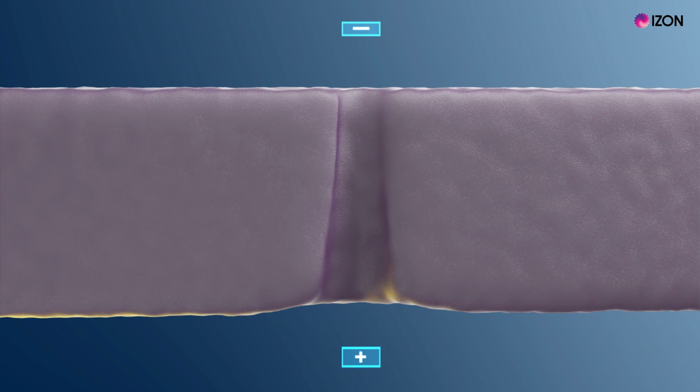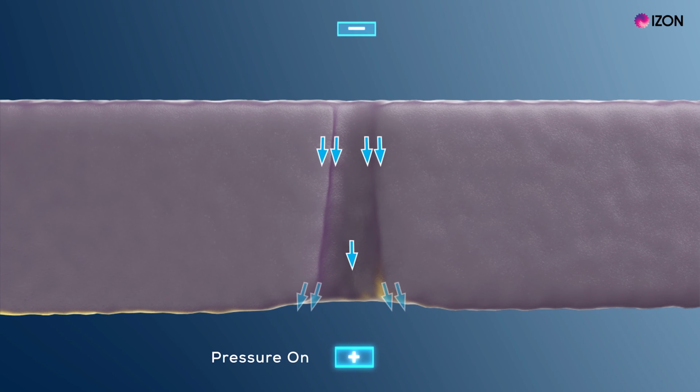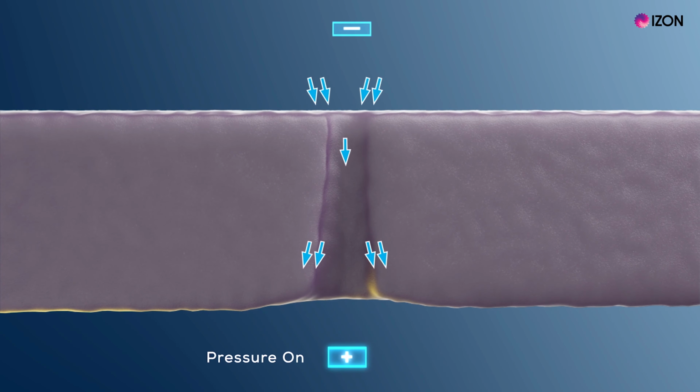These are a range of effects that are connected to a force acting on the electrical double layer, which forms at a solid-liquid interface. Let's now go through those three main transport mechanisms relevant for TRPS. Hydrodynamic transport is the result of a difference in pressure on each side of the nanopore. Due to this pressure difference, liquid will start to flow through the nanopore, similar to water flow in a pipe.